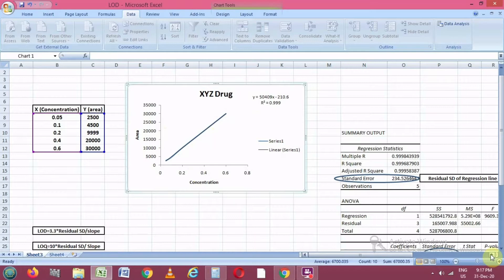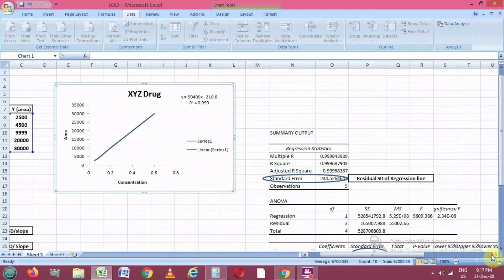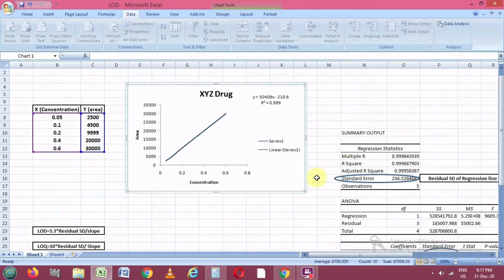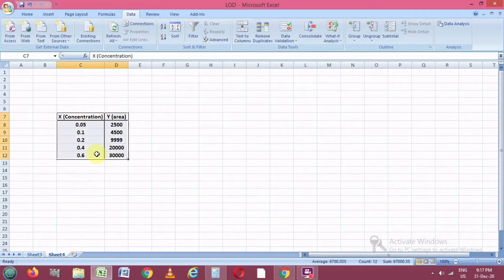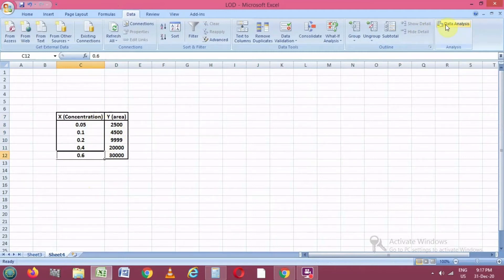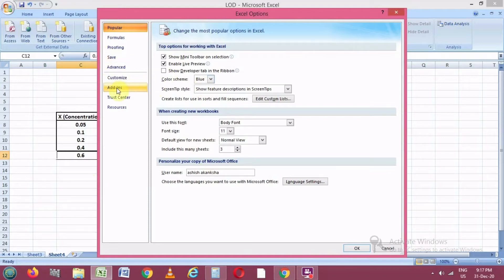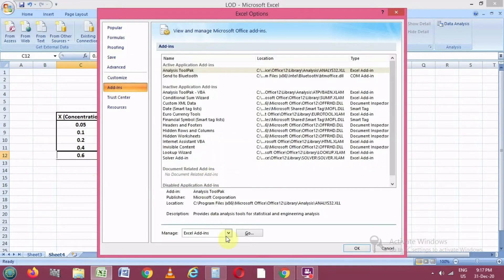After plotting this graph, we can customize it with labels such as area and concentration. Then we have to calculate the regression values shown on the right side of this Excel sheet. From these regression values, we will get the LOD and LOQ values by substituting them into the formula.